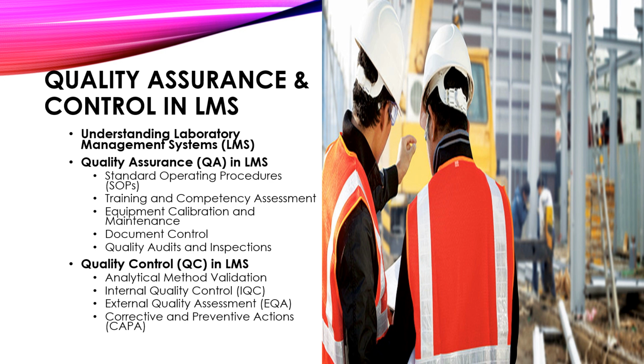Corrective and preventive actions, CAPA. Timely investigation and resolution of non-conformances, deviations, and incidents through CAPA processes is one of the key components of quality control in laboratory management systems. CAPA involves root cause analysis, corrective actions to address immediate issues, and preventive actions to prevent reoccurrence.